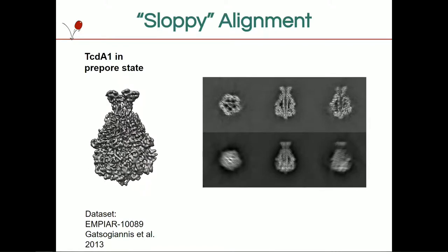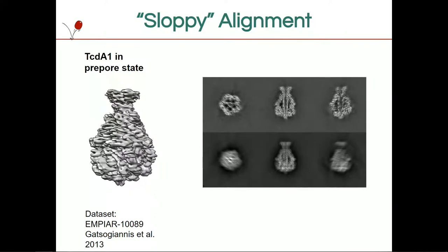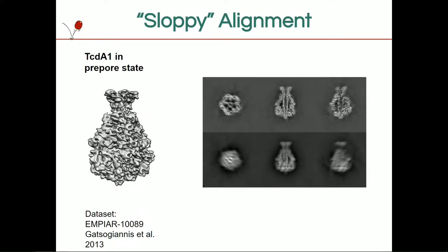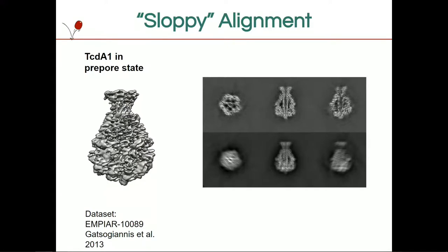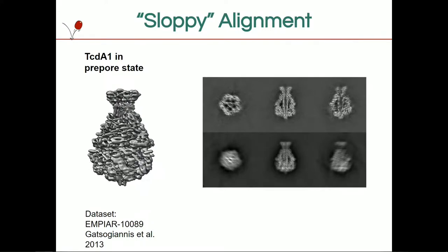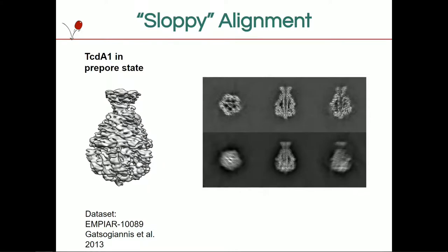The problem of this alignment algorithm that I described to you is illustrated quite well here. This is a nice five-fold pore complex. If you just do iterative refinement on this, what you see is all of the views go to one direction. It makes sense because there should be five directions that look exactly the same, but once you have one that looks slightly better than the other, they will all go to that direction. And you end up with this smeared mess where it looks good here, but it looks terrible here.